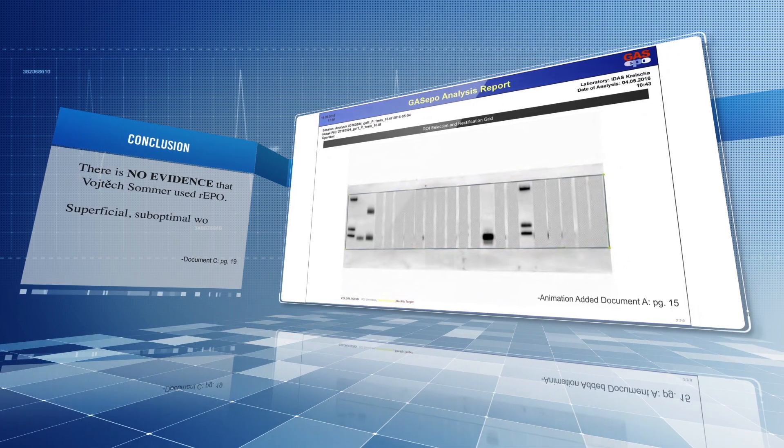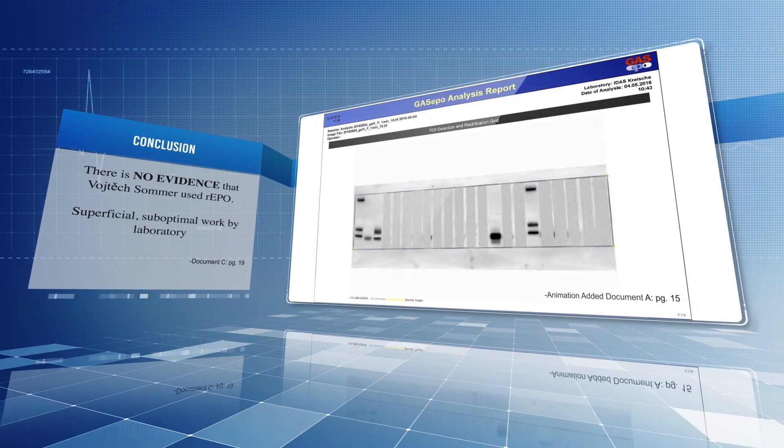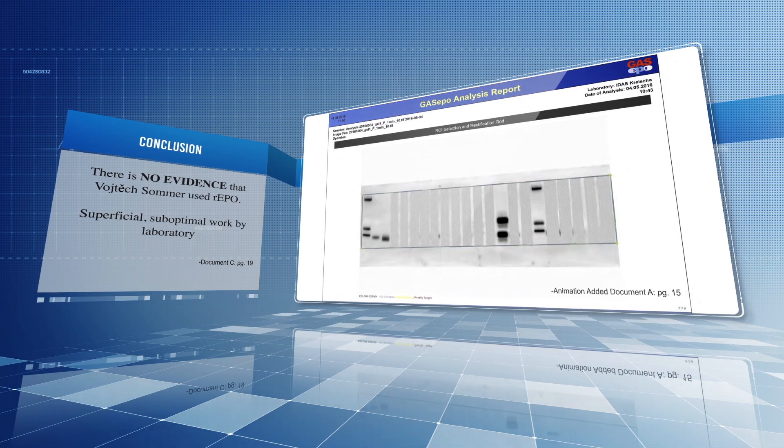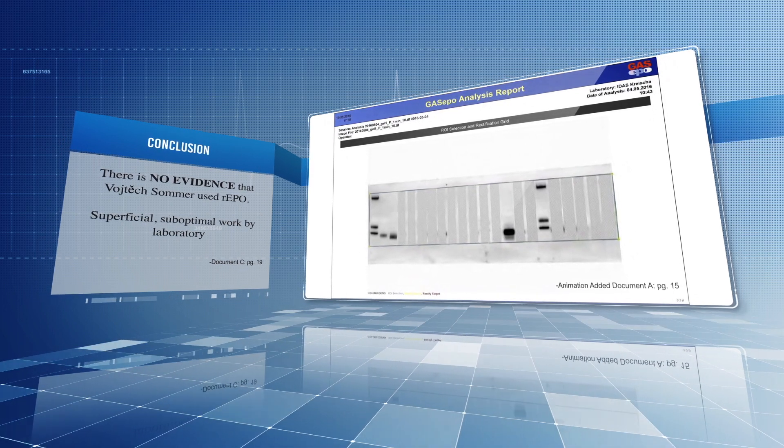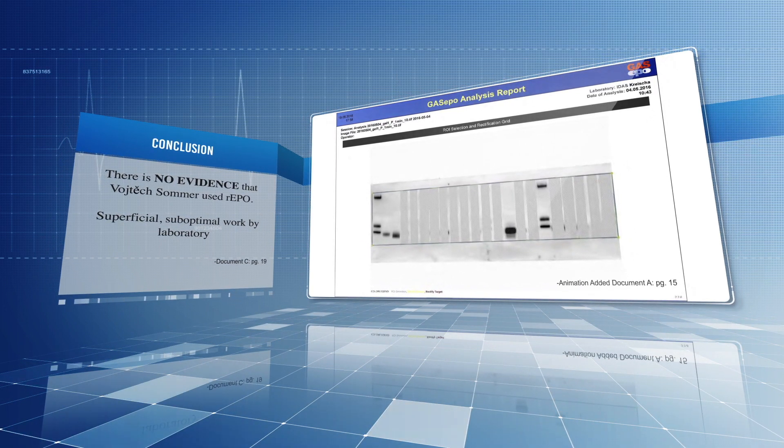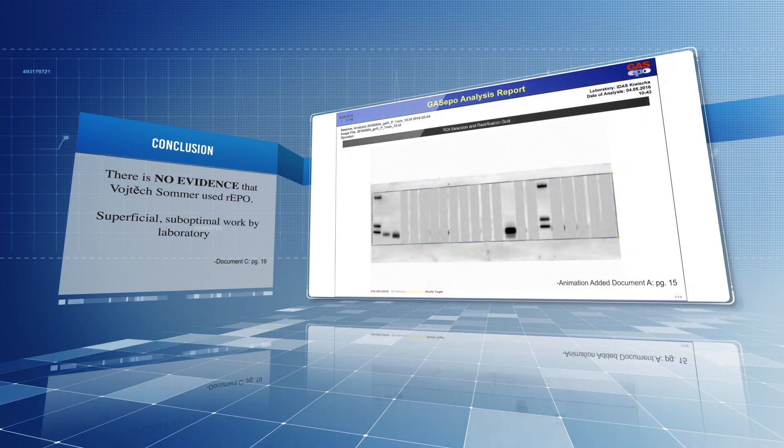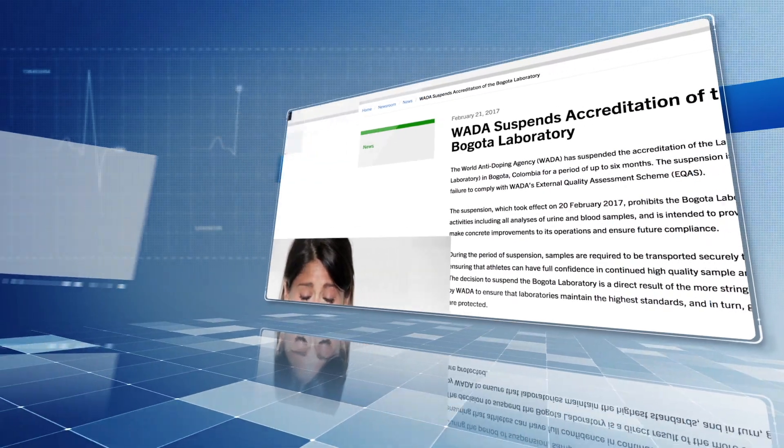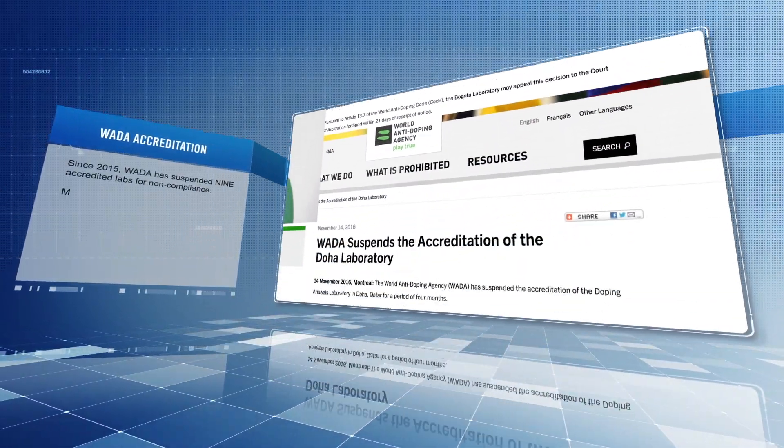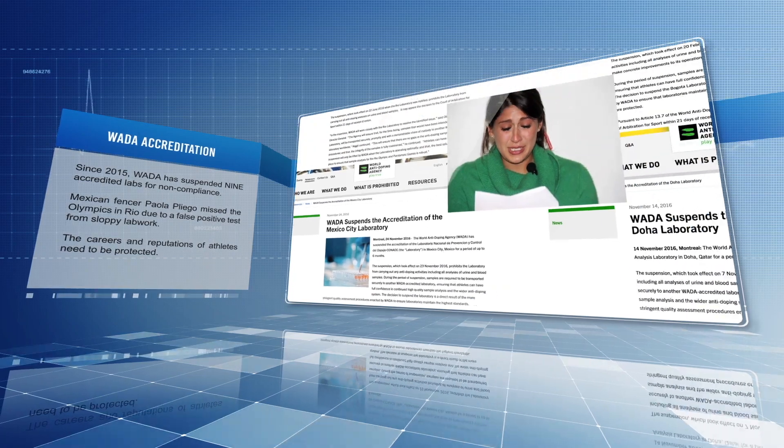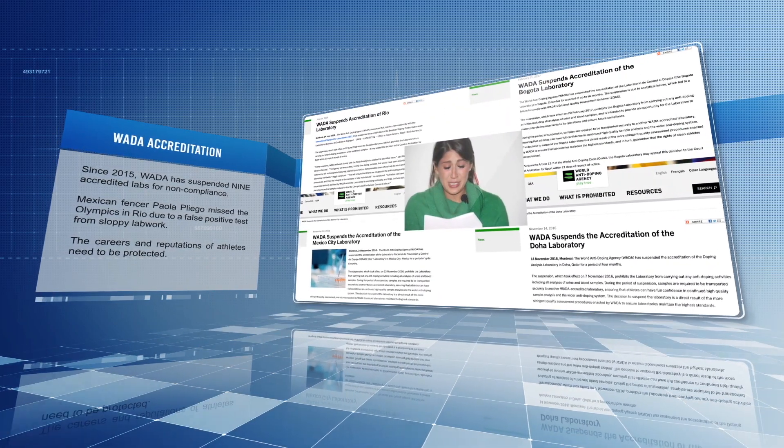From these results, there is no evidence that Vojtech Sommer used R-EPO. The laboratory's treatment of the analysis is superficial and illustrated again that all too many WADA-accredited laboratories produce suboptimal work that falls short of quality standards. Such behavior clearly jeopardizes the rights of athletes.